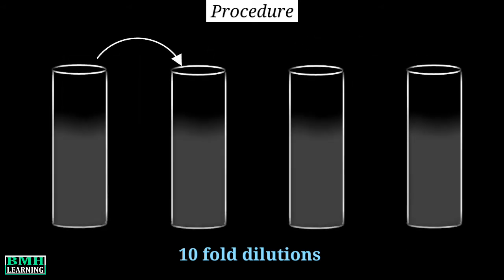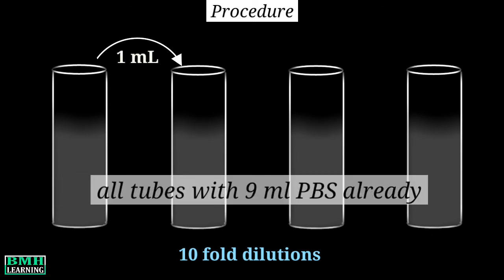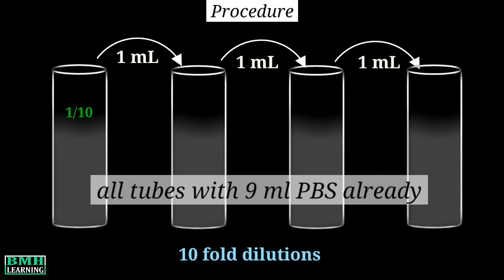From this tube, we take 1 ml and transfer it to the next tube, and the process is repeated for each tube. This way, we get 1 in 10, 1 in 100, 1 in 1000, 1 in 10,000, and this goes on. Let's suppose we are only making 4 dilutions.